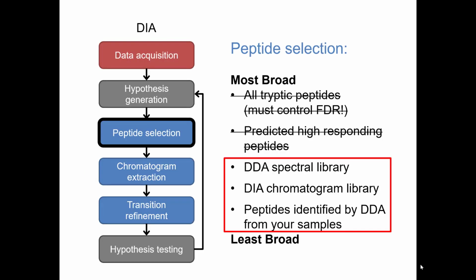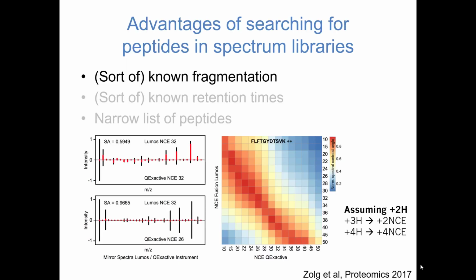Spectral libraries, I think, are the strategy that the Aebersold Lab has really dug its heels into, and I think it's a very effective, very good strategy. One of the nice things is it's kind of a feel-good story. We can reuse a lot of our old data that has been wasted and gone otherwise unnoticed after publication, and it makes me feel good to actually use some of that old data.